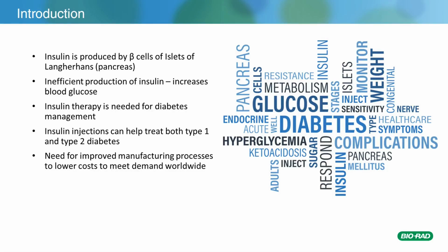Just some quick background before we go into the experiments. When there's not enough insulin, the blood glucose levels rise and you get diabetes. So therefore, there's a great need for economical insulin production in developing and non-developing countries.